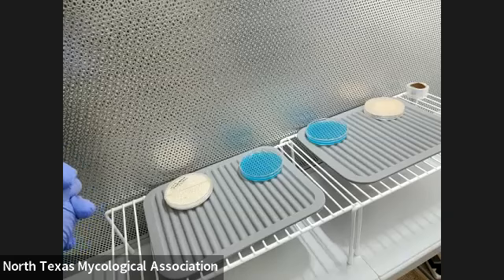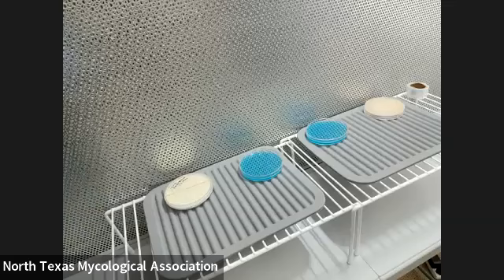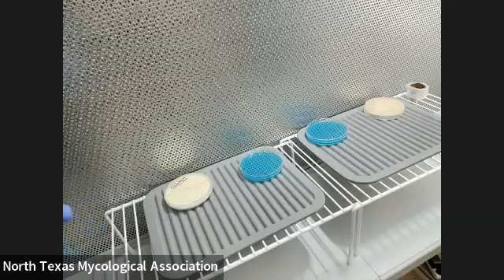Sterilizing the scalpel now. That's pretty cool — you can see it's heating up. It's just heating up the scalpel to make it sterile.